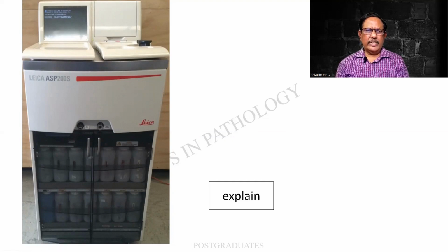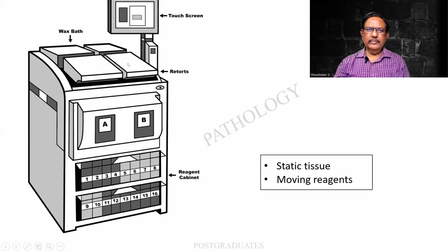You are not having the master plate in this case. It is all being computer programmed and controlled. If you cannot understand, again see this. So there can be a slight variation. In this picture, they show that there is a wax bath over here, whereas in our laboratory, it is over here. So there are two things here, and there are the various retorts by which we can be filling them.